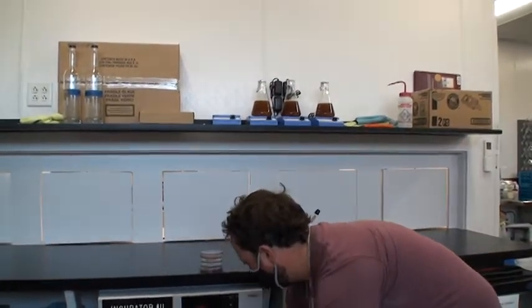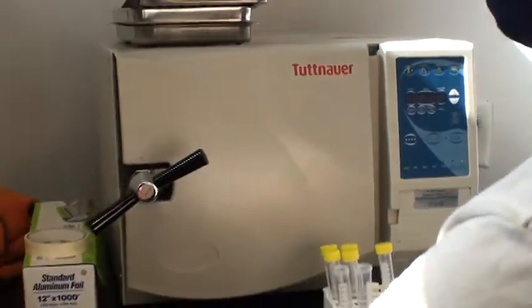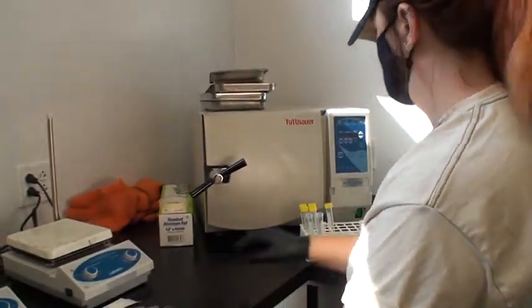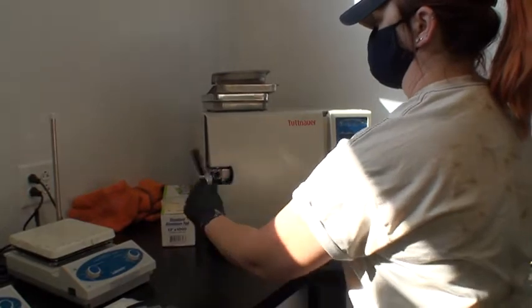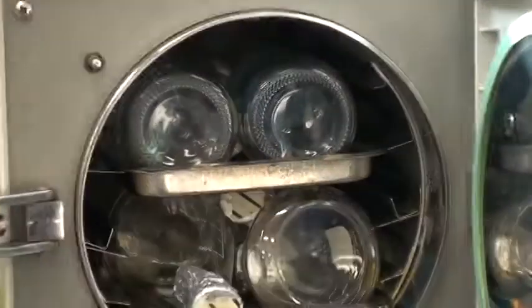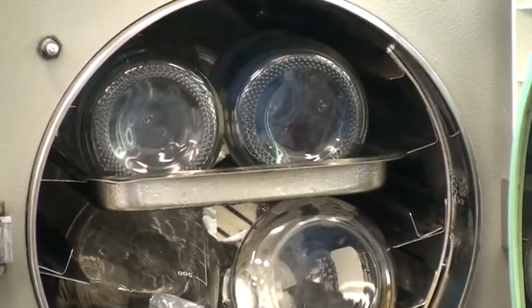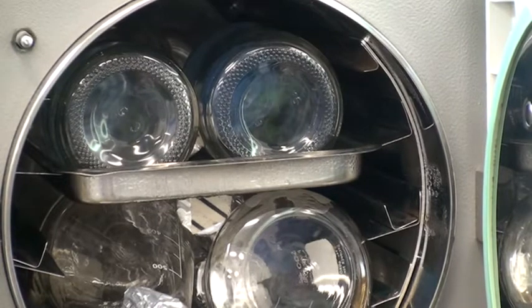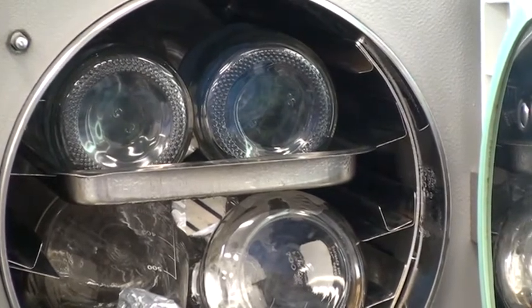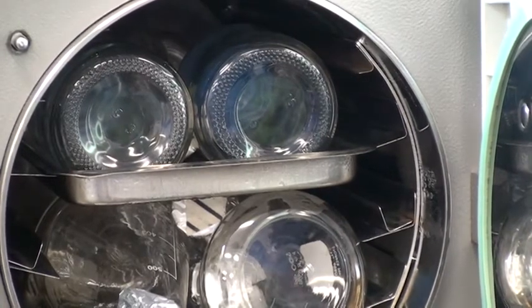This is the autoclave. Basically it's a sanitizer — like a pressure cooker. It's about 273 degrees Fahrenheit at 30 PSI for about 15 minutes, and that kills just about everything. You can see the steam rolling out of there. If it doesn't kill it, it deserves to take over the world.